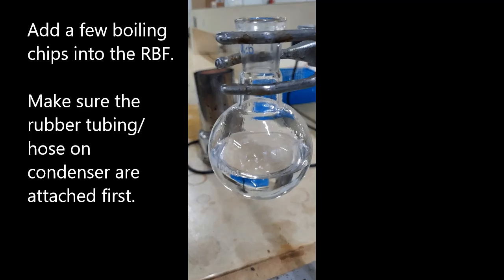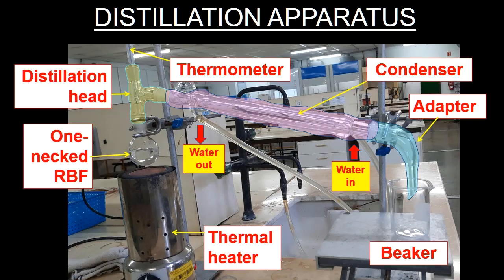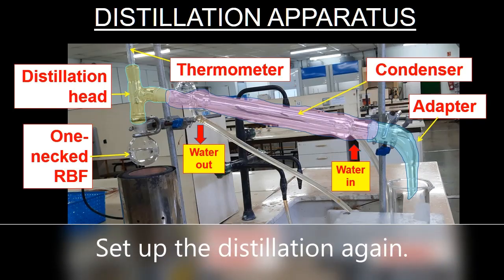Ensure that the rubber tubings are fixed to the condenser before setting up the distillation apparatus. Assemble the distillation setup again beginning by clamping the round bottom flask. Take note of the setup sequence as shown earlier.